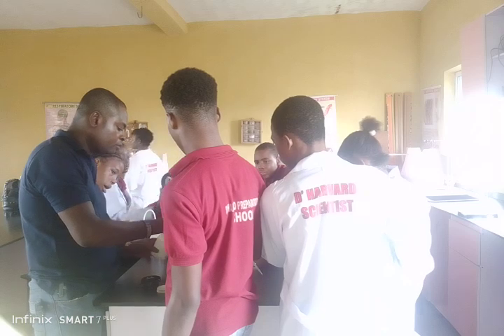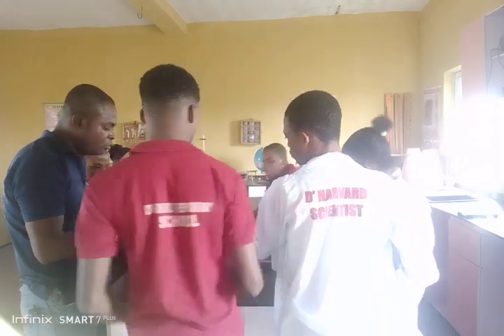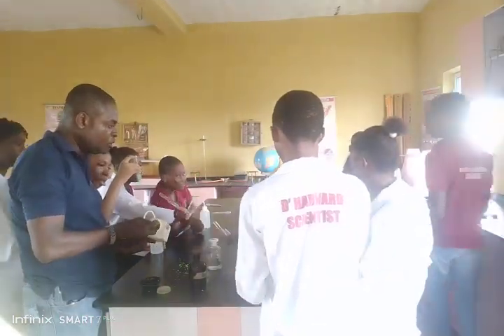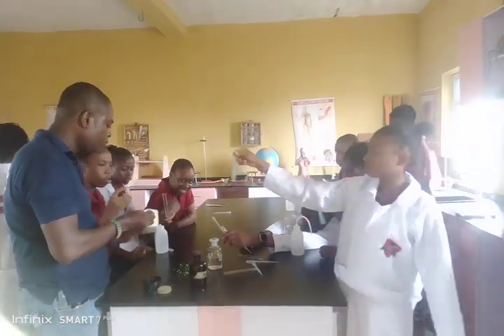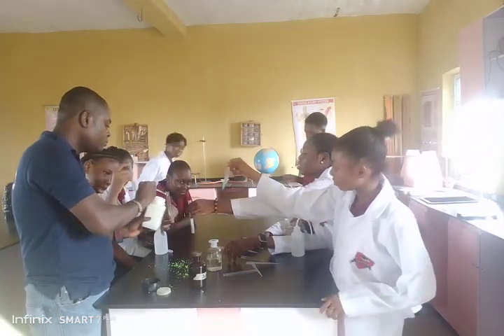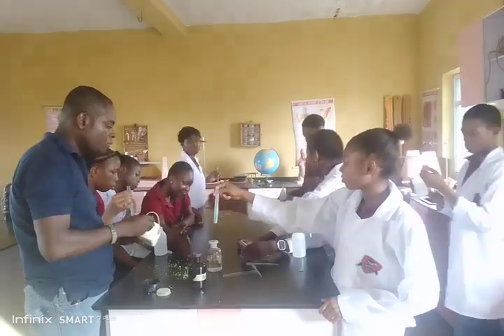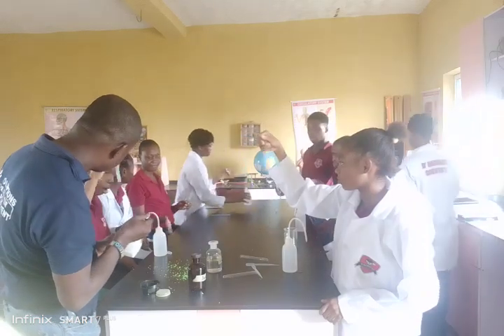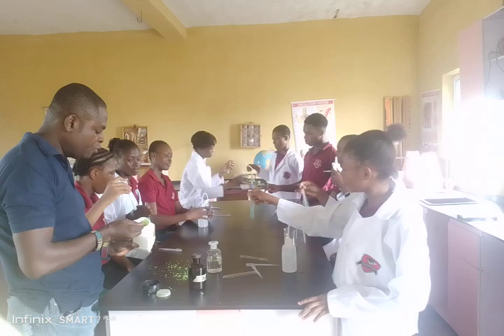One test tube, sir. It will be good test tube. The instruction will carry it in the test tube. So shake it thoroughly. Shake it thoroughly. Yes, who has not got it? Yes, shake it thoroughly and see some particles down. Who else has not got it? Come on, please. Let me be doing my own too.